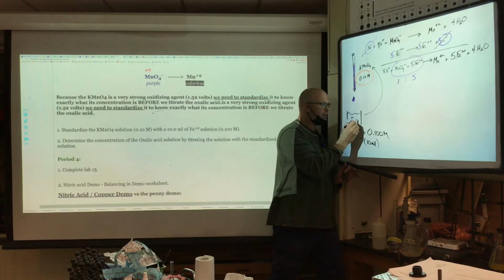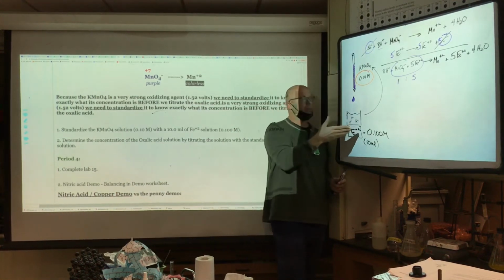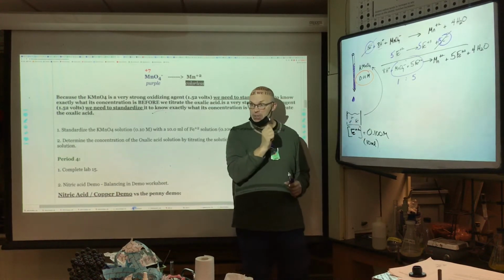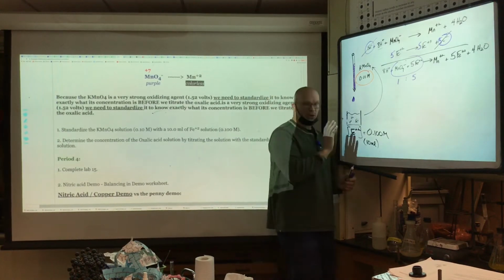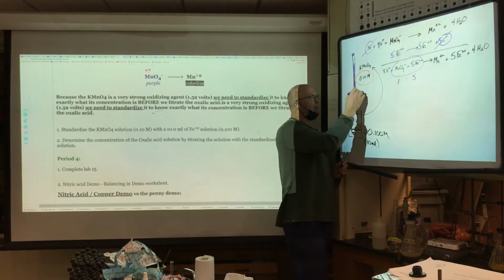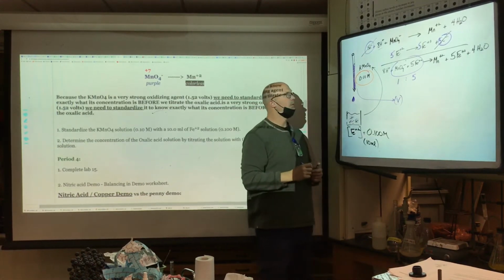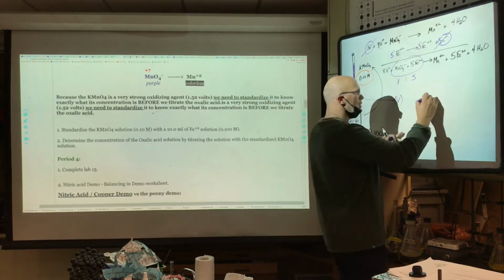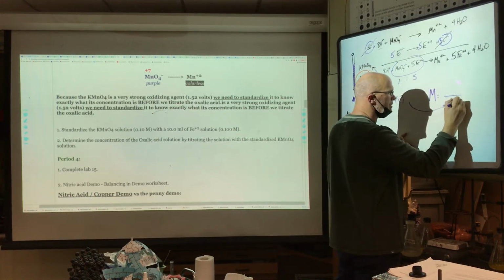And there's Fe+2. And so what you're going to do is carefully add the titrant to the analyte. And you're going to stop when the potassium permanganate persists, just like you were using an acid-base indicator, but you're not. When you're done and the slight purple color persists, you're going to measure the volume of your KMnO4. What's the whole purpose of standardization? To find the molarity. To find the molarity, you're going to use that volume. Make sure that volume is in liters.